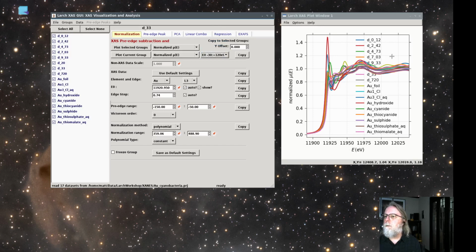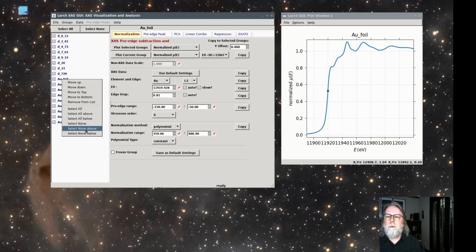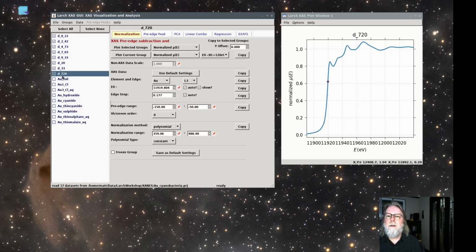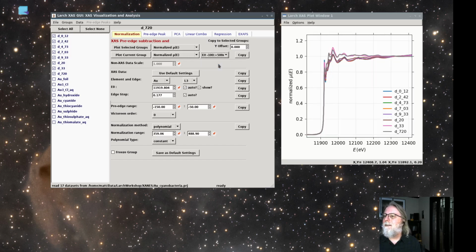And now when we plot those with our standards, you can see much more variation among the standards than in the data itself. So probably we will find that these data are fairly consistent with one another and appear to have only a few components.